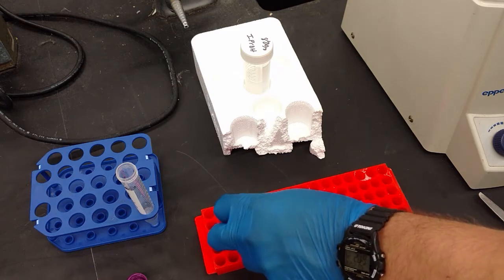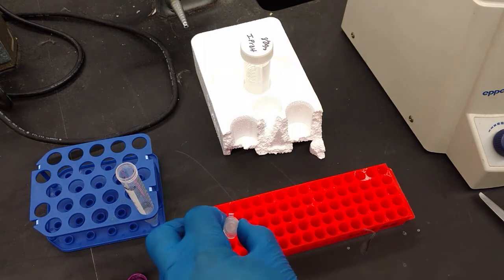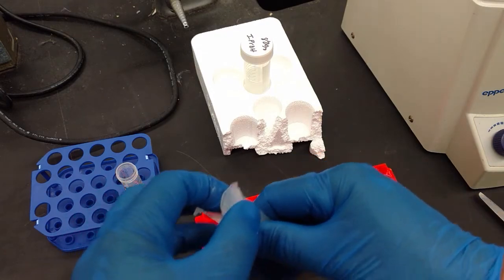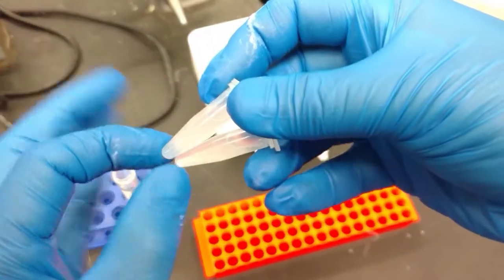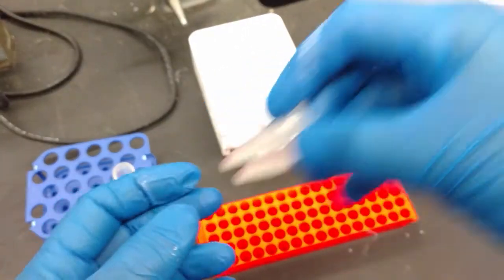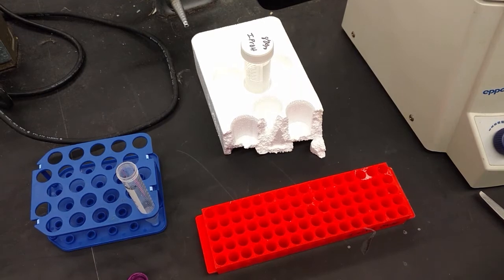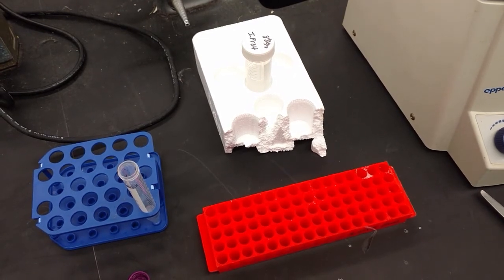So now you have your sample. It's all nice and gray, no lumps. And so now we need to spin it again and we're going to spin it for three minutes to bring the DNA back down into the pellet, to bring the resin back down into the pellet, and to pull the isopropanol up to the top. Again, make sure the lid's on.